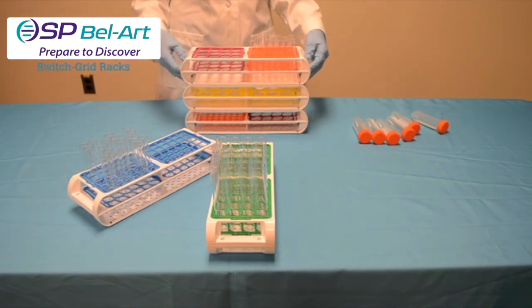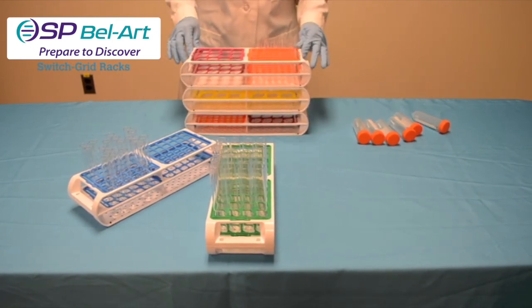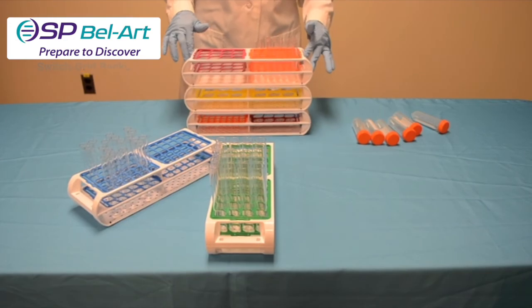These innovative racks are more compact and less expensive than purchasing multiple racks and are useful for both sample processing and storage.